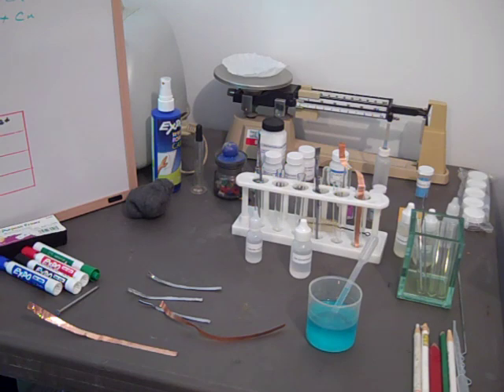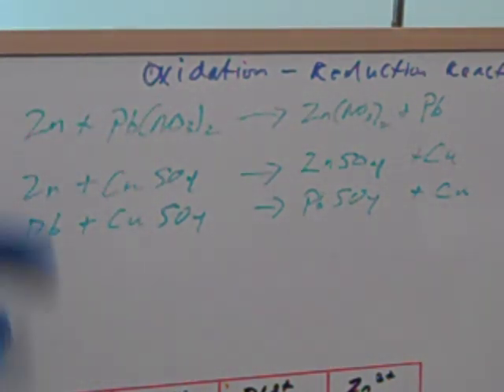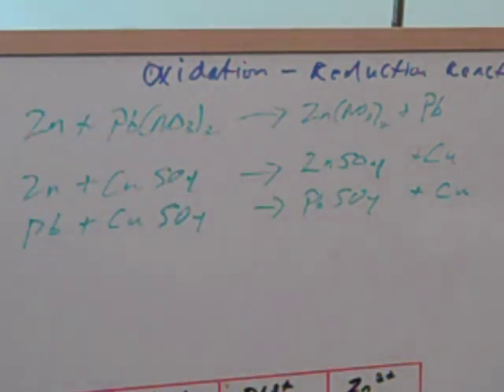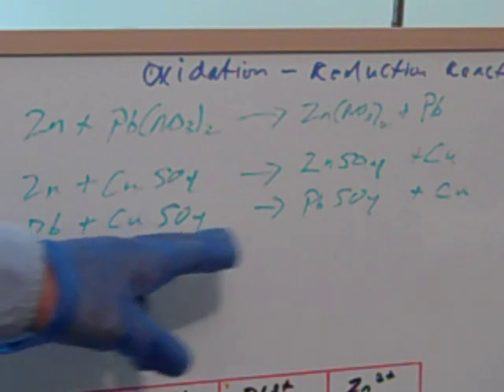Let me show you now what we expect to happen. It's always good to get an idea of what you expect to happen before you do the experiment. We already checked the activities of the three metals we're using, the zinc, the lead, and the copper, and we found that the zinc is a more active metal than either copper or lead. Lead is more active than copper. So in our experiments, we should see zinc replacing the lead and being oxidized to zinc nitrate, leaving lead metal in the atomic form. The same way we expect zinc to replace copper in copper sulfate and become zinc sulfate, Zn2+. And we expect lead to replace the copper in copper sulfate as well.